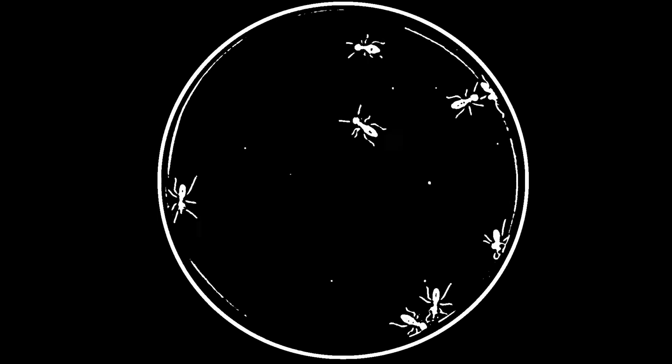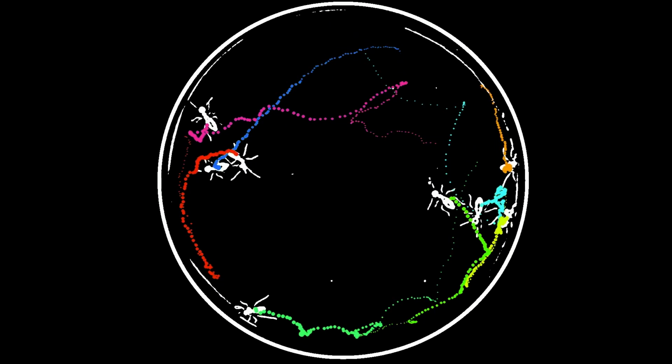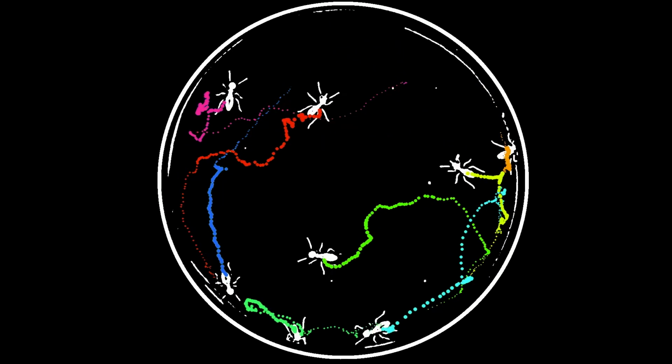And I'm Simon Jean. We'd like to introduce you to a software that we recently developed called TRACKTOR, which is designed to track animal movement and behavior. We worked on this together with a colleague, Dominique Roche.